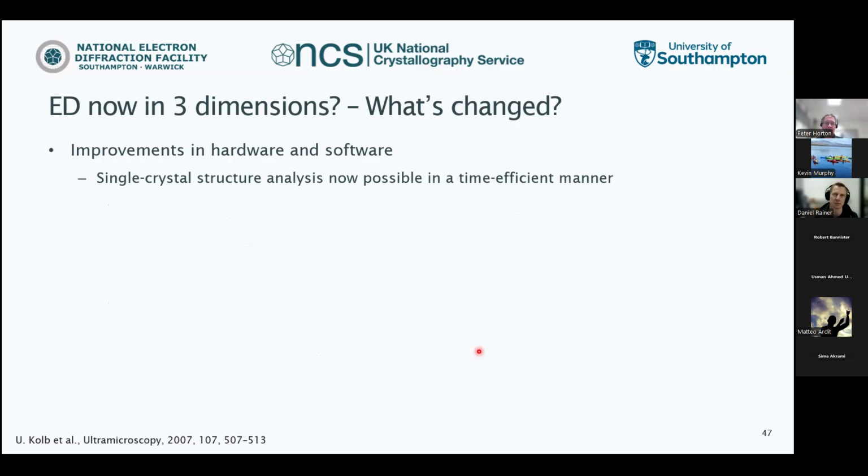This has been developed in the past couple of decades, because there have been quite substantial improvements in detector technology and what's possible with software. This means that now it's possible to perform electron diffraction in quite an analogous way as single crystal XRD has been performed.